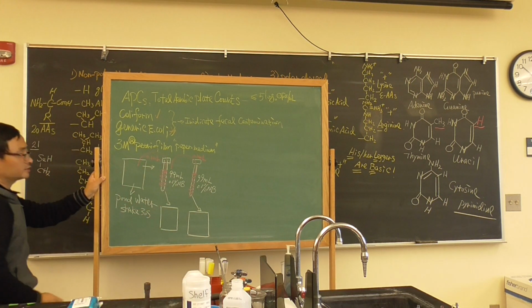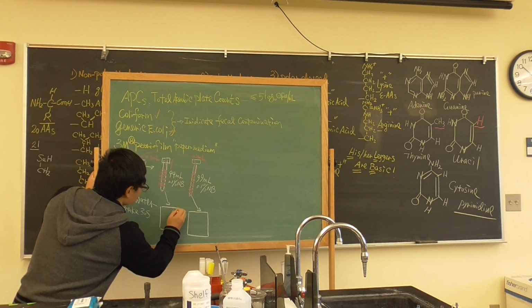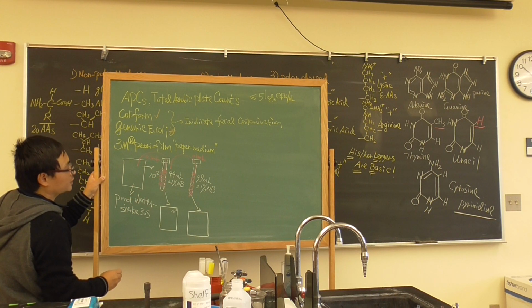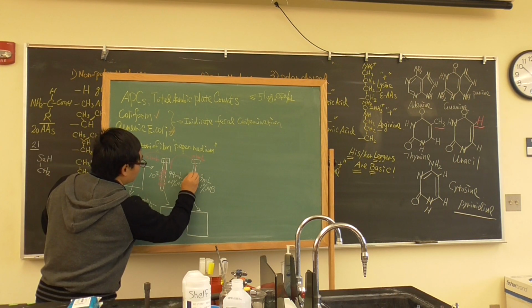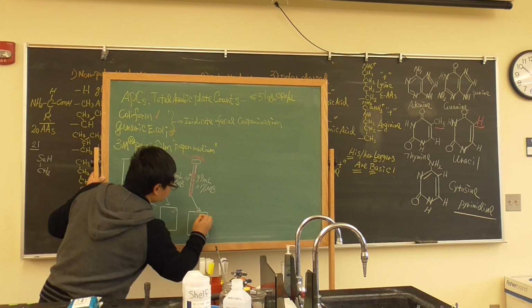Therefore, what's the dilution factor of the first one? It is 10 to the 2, and the tube dilution is also 10 to the 2. What's the dilution of the second one? It is 10 to the 4, and the final dilution is also 10 to the 4.